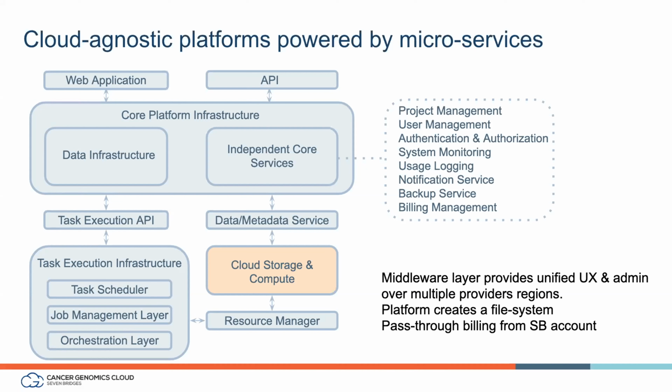Conversely, having this file system can result in a little bit more effort for us. We have to maintain the file system and all the different services. And it does also mean that we have to spend a bit more time indexing, because having that information there to be more performant means we have to put it in there in the first place. So we will be referencing the file system throughout this talk and how it informs how things work on the platform.